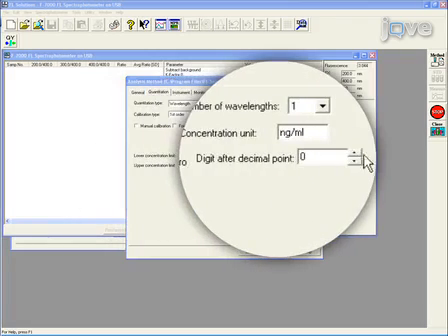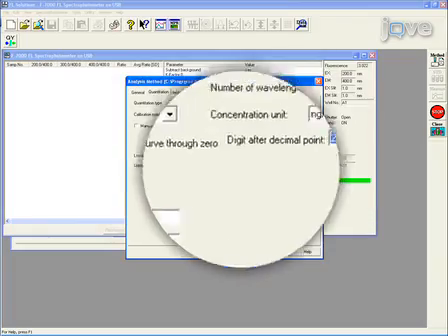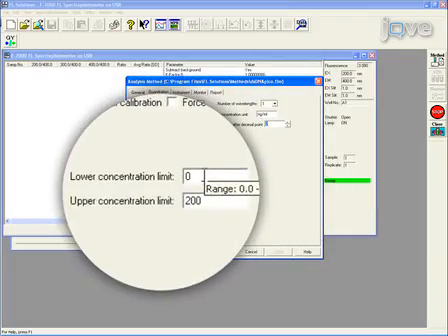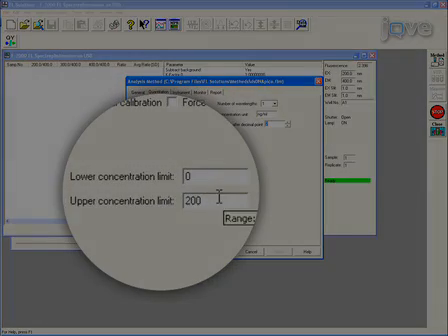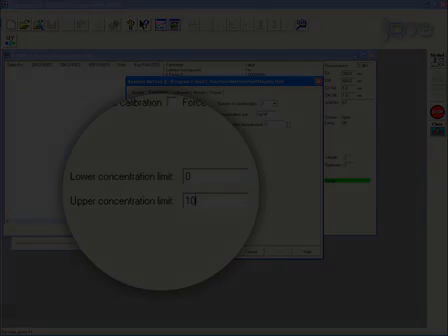For digit after decimal point, select two. Enter zero for lower concentration limit and 10,000 for upper concentration limit field.